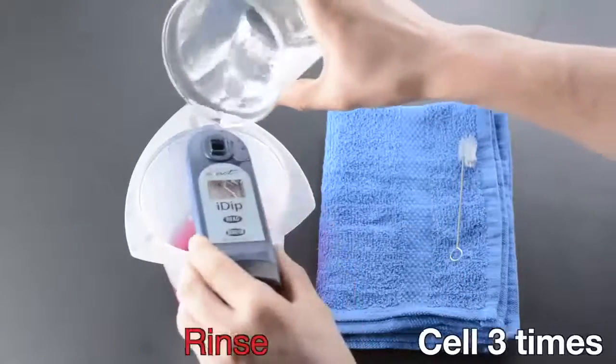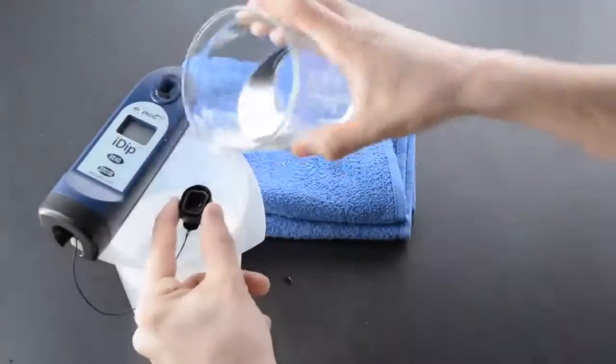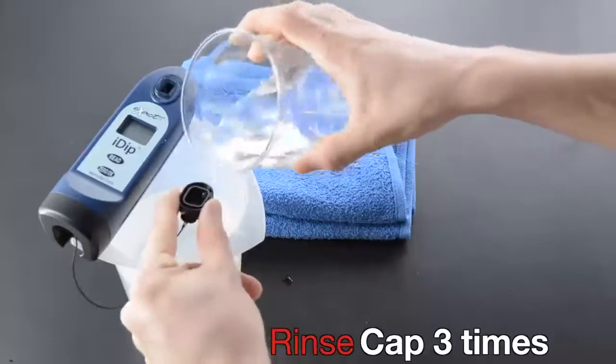Rinse cell three times and rinse cap three times.